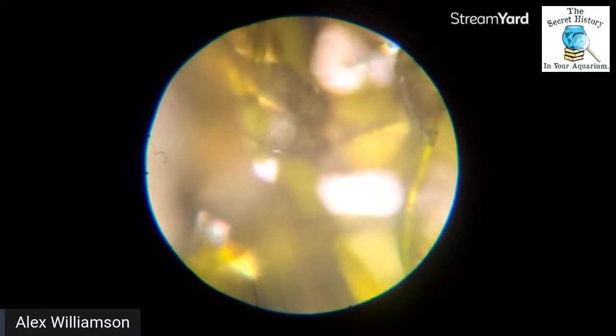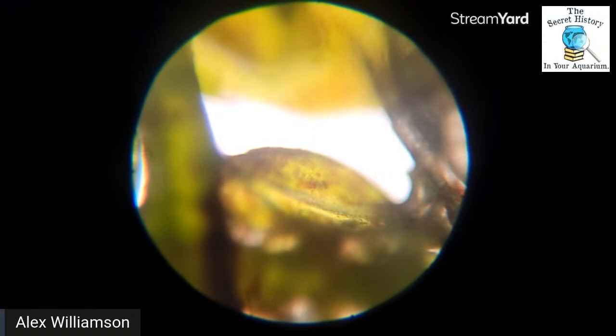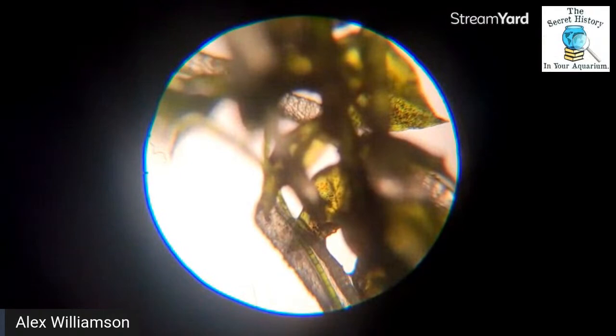So here we are zoomed in all 100 fold. And again, you can see organelles in the cells. You can see that red? That might even be like the mitochondria of that cell, which would produce the energy. So we can actually make out the cells and the pigment in these. And again, you can see even smaller cells up above, differentiated cells. Let's zoom back out again like we were, so you guys can see what we're even looking at.